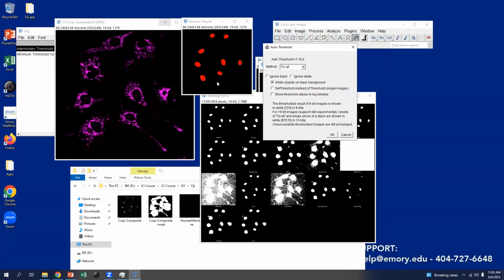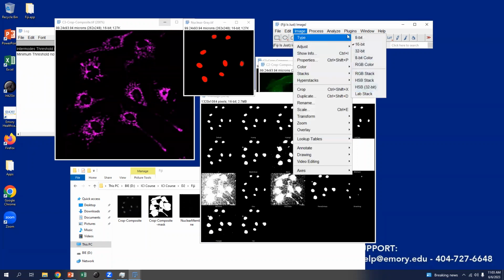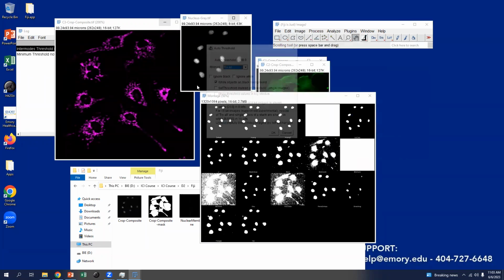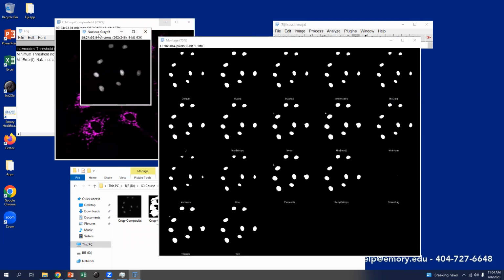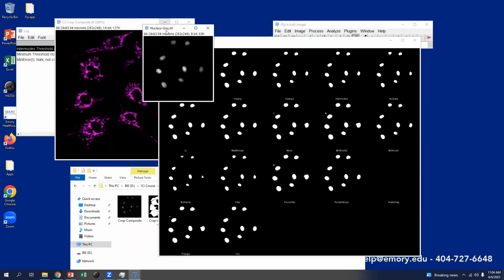Something to note, it recommends we work on an 8-bit image. They support 16-bit images, but it could take a while and it may crash. Oh, interesting. This is, in fact, a 16-bit image. So we saw how the process worked when it was 16-bit. Let's try it now as an 8-bit. Much faster. But as I mentioned yesterday, that can trim some of the brighter data away because we're casting it as a lower bit depth.